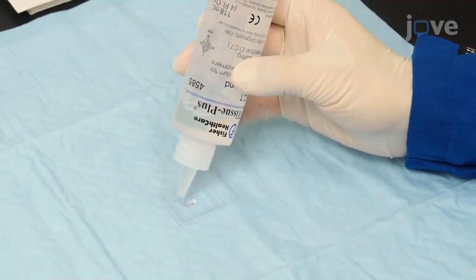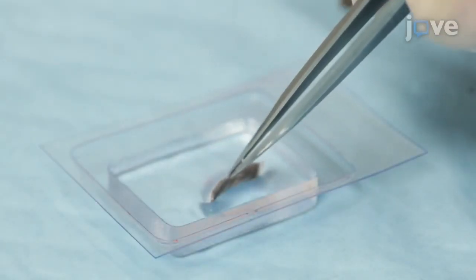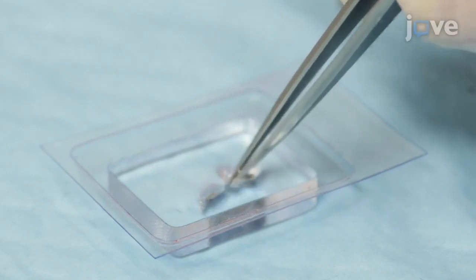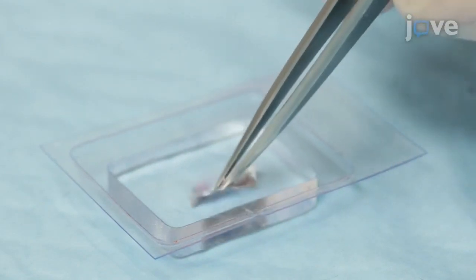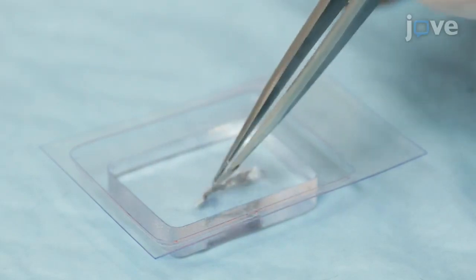Next, fill the cryomold with freezing reagent compound. Using needle-nosed forceps, place the skin sections into the filled cryomold. Orient the skin sections so that the cross-section from the epidermis to the dermis, hypodermis, and muscle is visible.